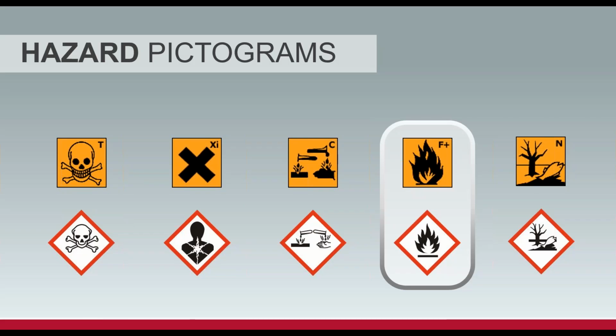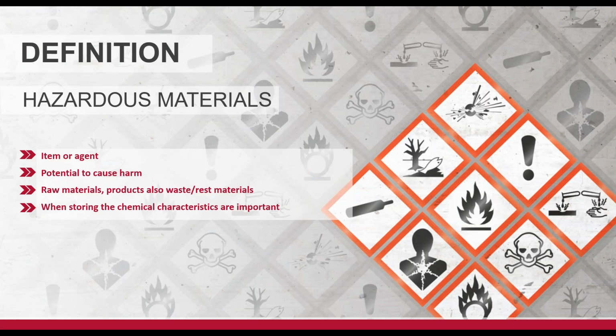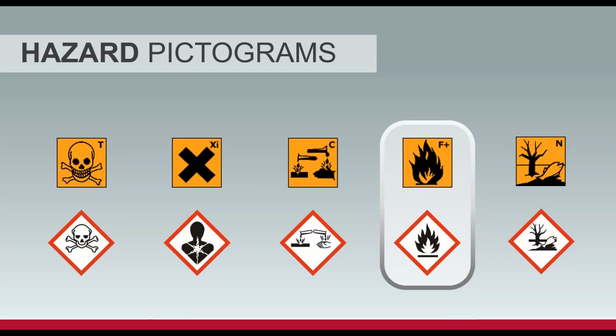Now, all of these that I show you there, those are all GHS symbols, right? We're going to concentrate on the middle one. The reason GHS really came on the market is simple. We all did it different. So in your country, it was different than what it is here in the US, which is different than Mexico. When you go to Europe, each one of those countries all had their own symbols as well to denote things.